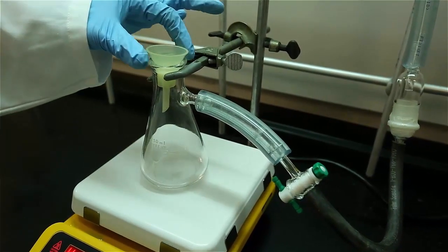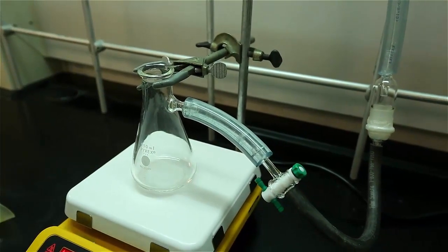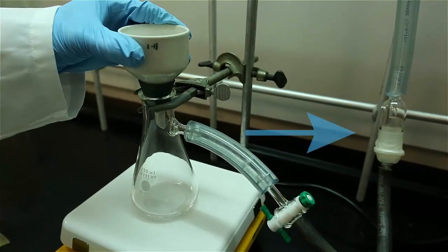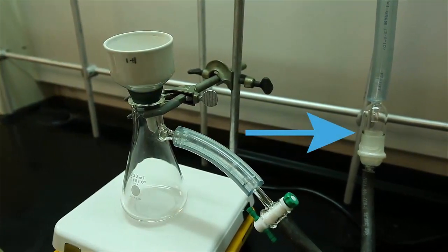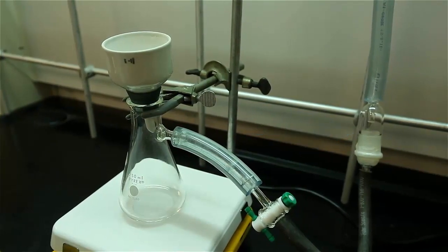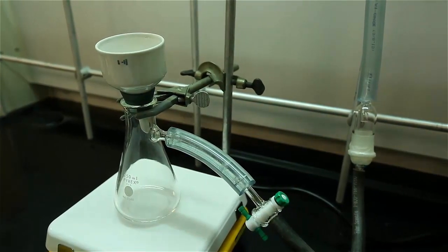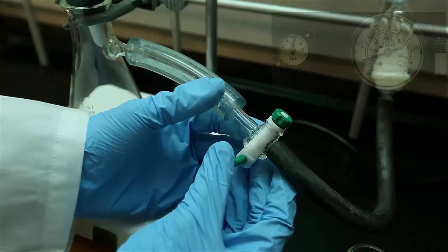You would need to decide whether to use the Hirsch or Buchner funnel. The plastic Hirsch funnel is used for small volumes, unlike the larger porcelain Buchner funnel. Notice the trap connecting the vacuum apparatus and the sidearm receiving flask. The purpose of the trap is to prevent the filtrate from reaching the vacuum apparatus.